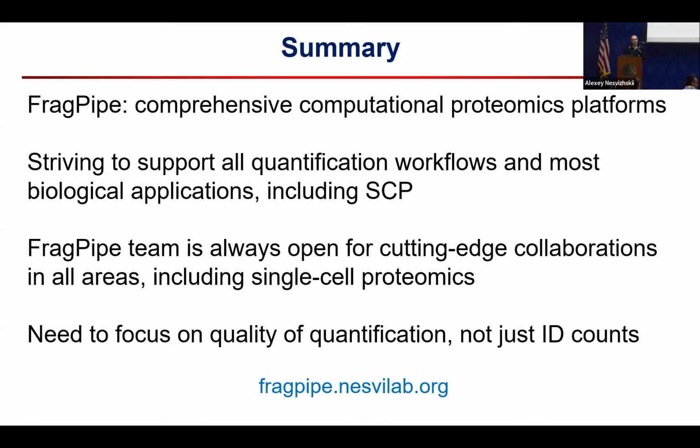I wonder about prediction. So it's relatively easy to predict retention time, cross-section, or fragmentation of MS2. And I wonder how useful it would be to be able to predict MS1 intensity, so we know which peptide from a given protein should be observable, and if we don't see them, we know they are modified. And can we also use this information for scoring and other things? I wonder what you think about MS1 prediction?